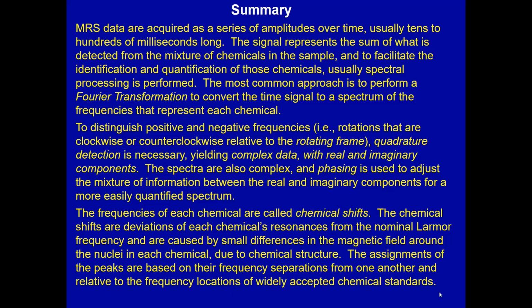So it's time-consuming, painstaking work, but it's worth it once it's well established. Then everybody can refer to that peak. They know what it's supposed to look like, and they know it belongs. That concludes this lecture for the NMR physics course.